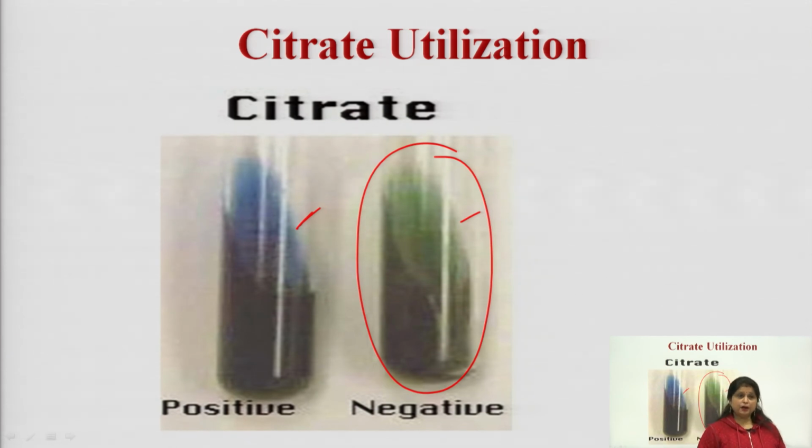In the indole test, we try to identify the bacteria which release an enzyme known as tryptophanase by using a broth containing tryptophan.